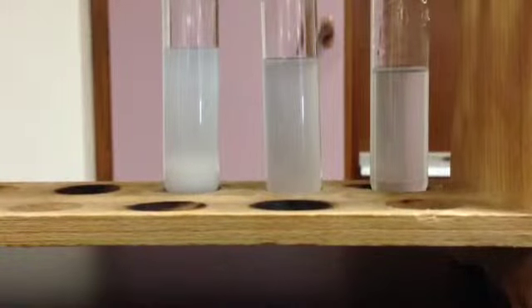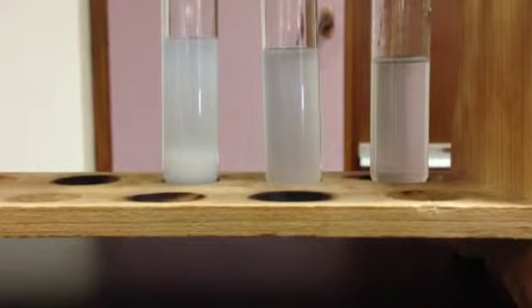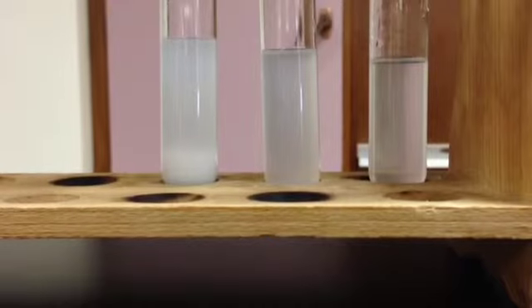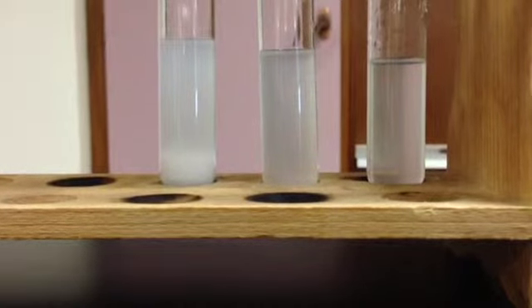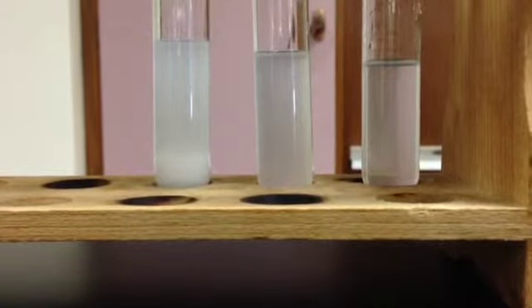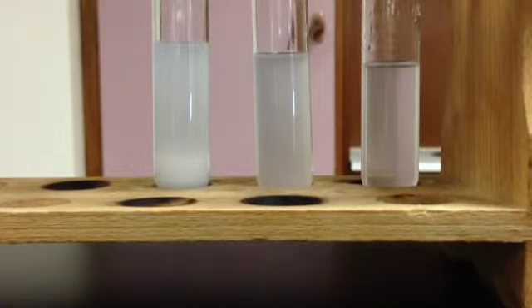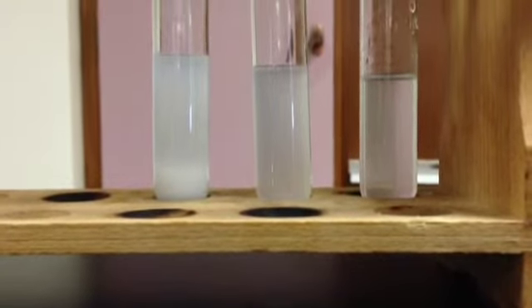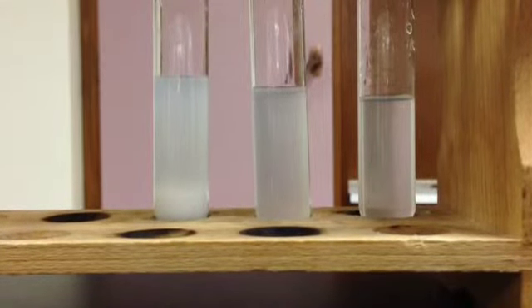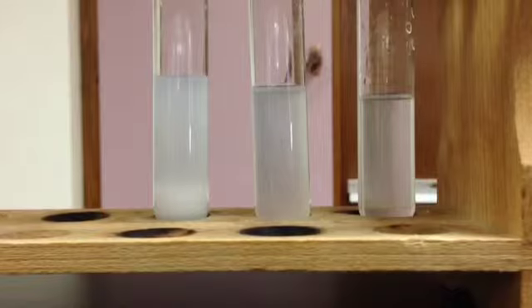As you can see, the last 2 test tubes have dissolved. Even though they are cloudy white, they are still in the process of dissolving. Unlike the first one, that is pretty much done dissolving because we went over the solubility of salt, because it has a remainder of 1.34 grams of salt. And that is why it has a milky white color, unlike a cloudy color like the last 2.